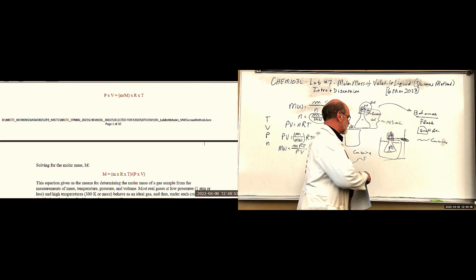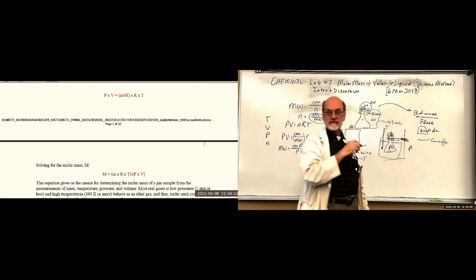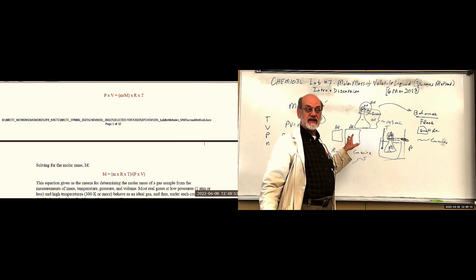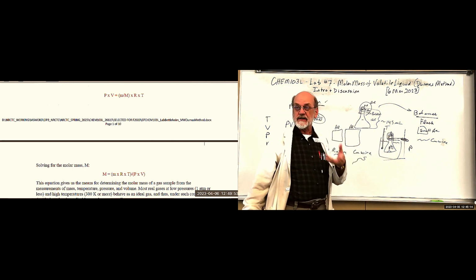Of course, you're going to measure the temperature, right? You're going to measure the temperature. You're going to have the barometric pressure, temperature, pressure. And then you're going to get the mass, after you pull it out and towel dry it, and then pull the big aluminum sheet off, then inspect the top of it to be sure that you don't have any condensation on it.